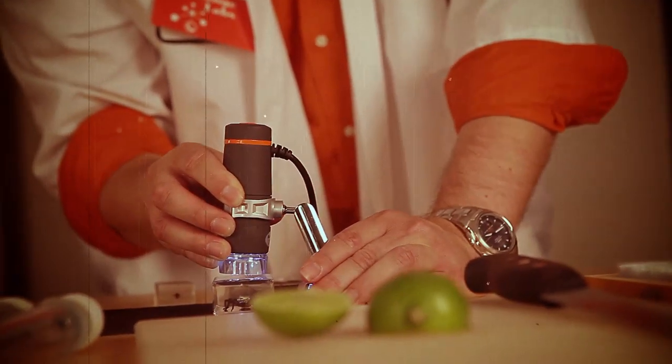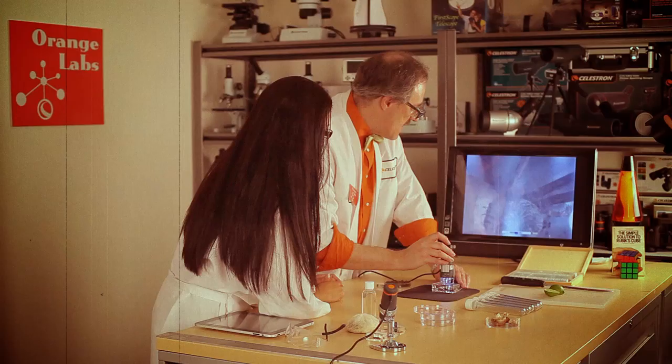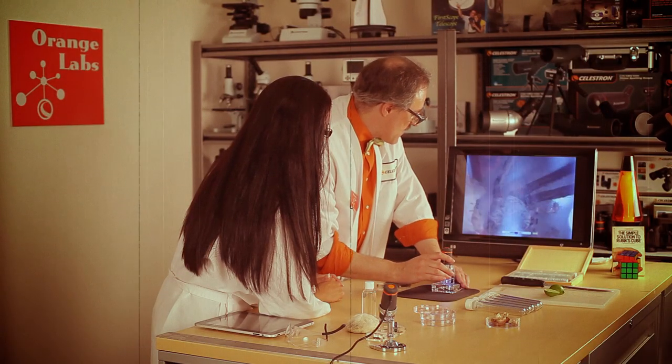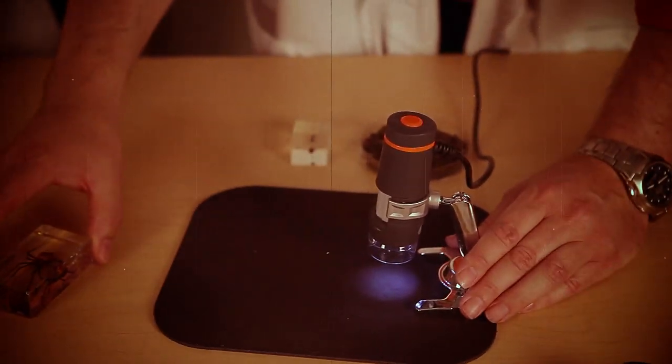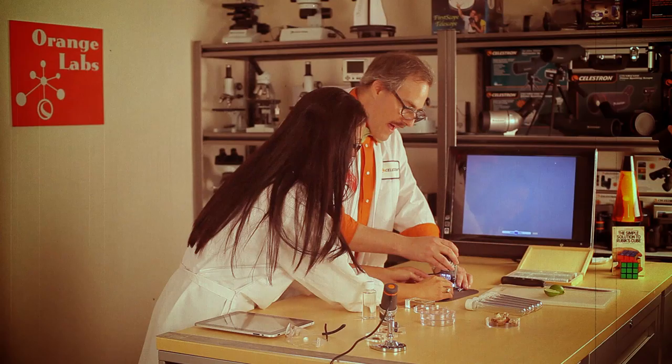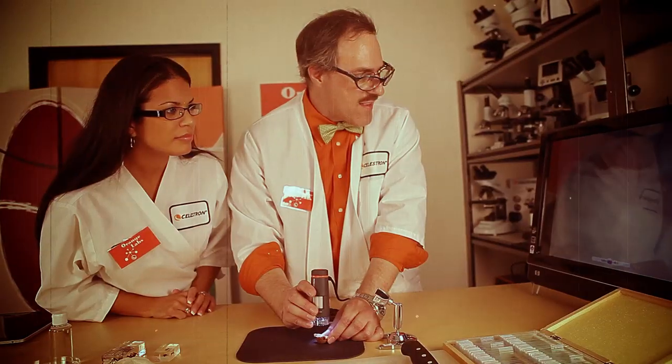Let's see how easy it is to take a picture. All I have to do is press this big orange button. Just like that, and now we have a picture. It saves them right onto your hard drive. Amazing. Let's try something else — why don't we try the shell? I'll have to take it out of the stand and put it on the shell. Doesn't it look like gills? It does look like gills.